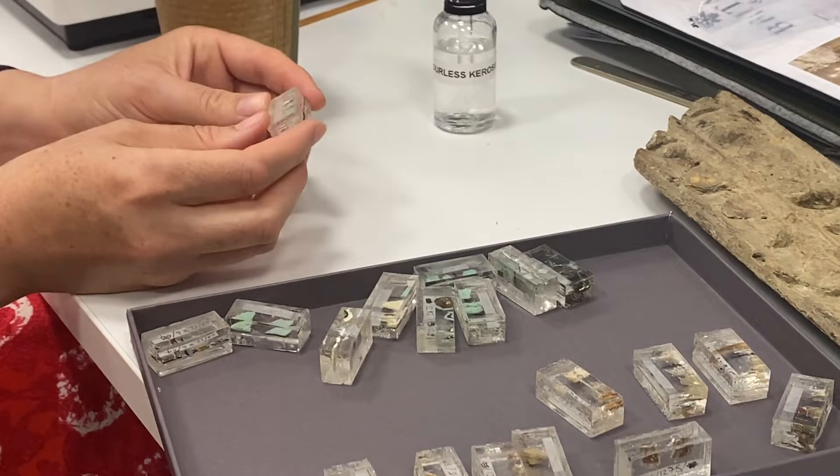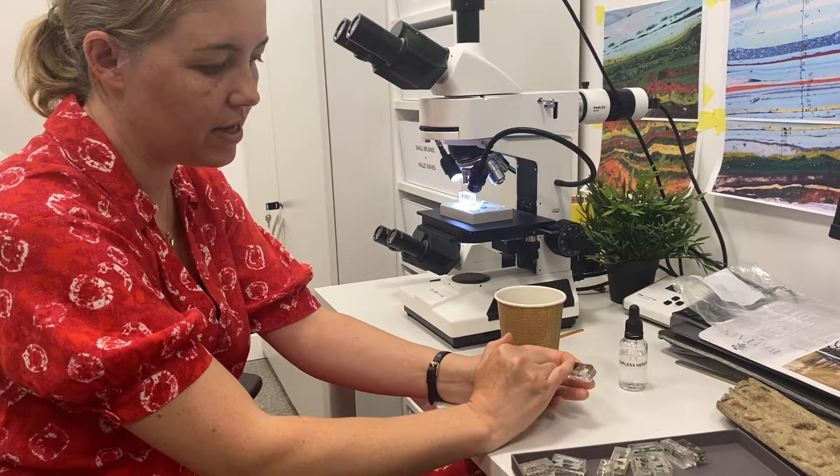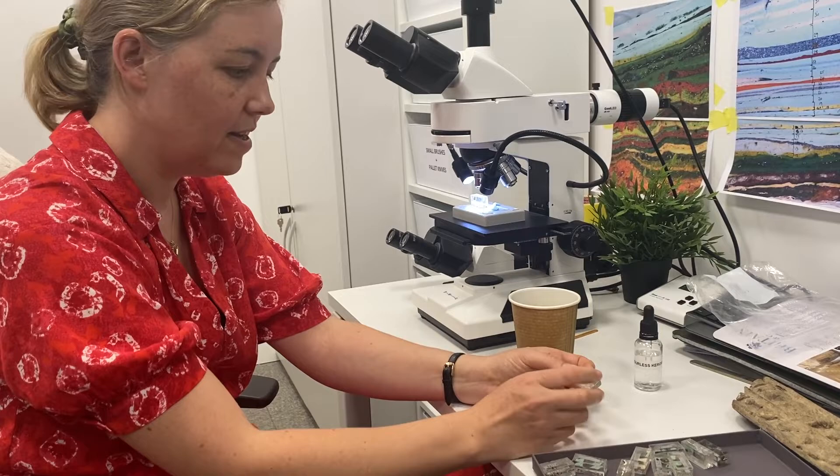Then I take the samples out of the bag and take a look at them and try and find the best part of the samples. Quite often I need to cut them down to get to the right part, and then I lay that right up against the edge within the mold and glue it into place so that it doesn't start floating away when I do the pouring.